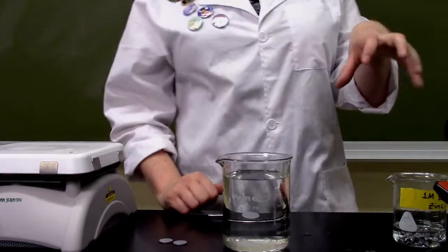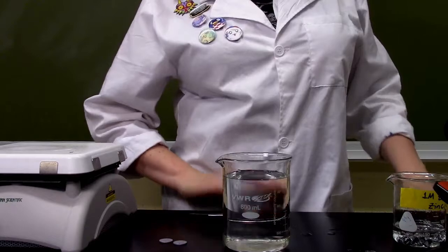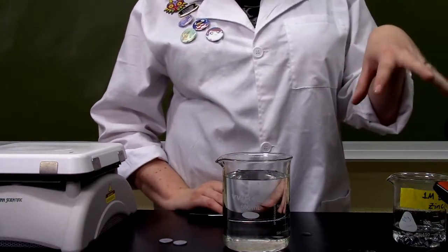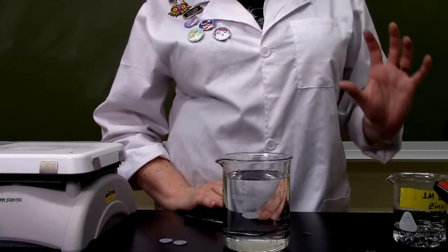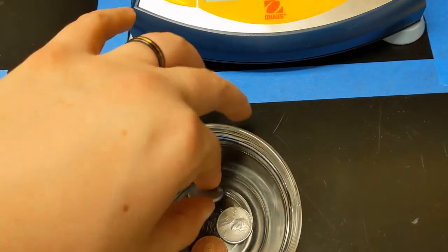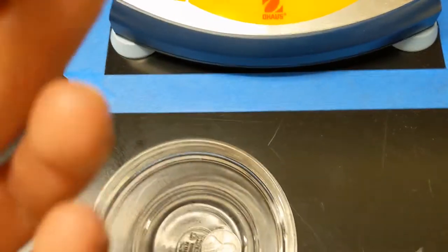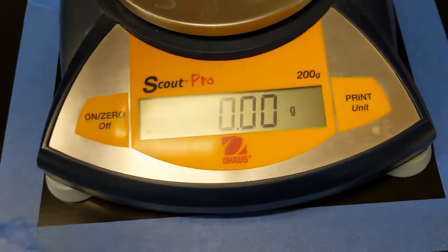At this point, I'm going to leave this beaker to cool on the countertop. The countertops are specially made to be able to handle heat, and this is special glass that doesn't crack when it cools down quickly like this. I have dried these off. And so this is our 1975 penny. Our balance is zeroed. Let's see what we're at.